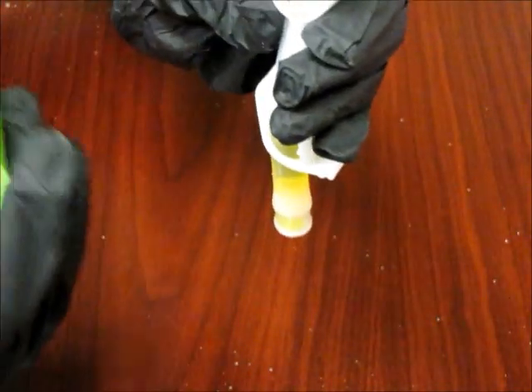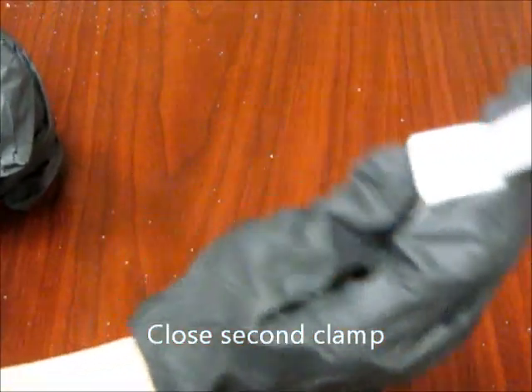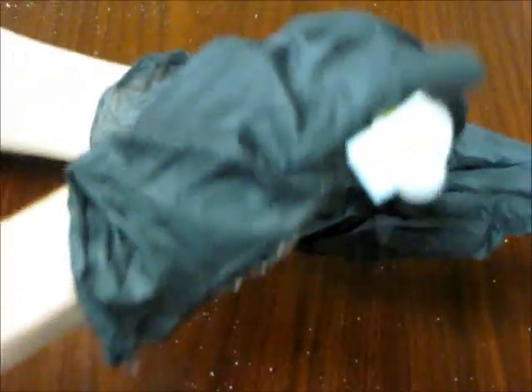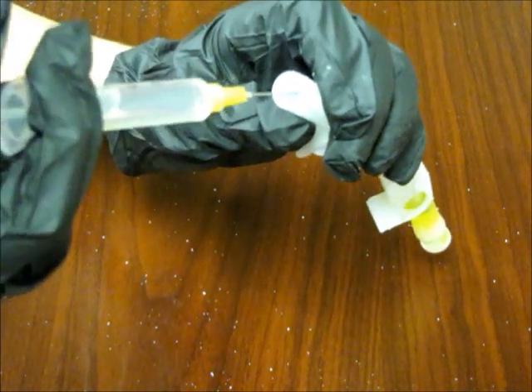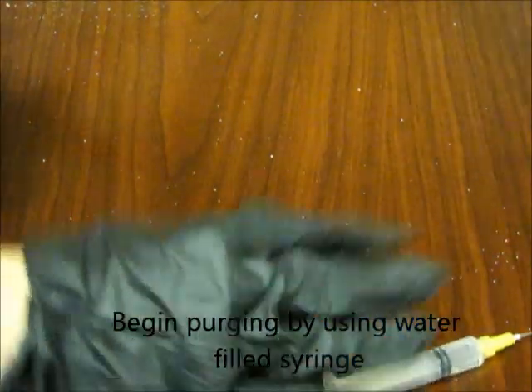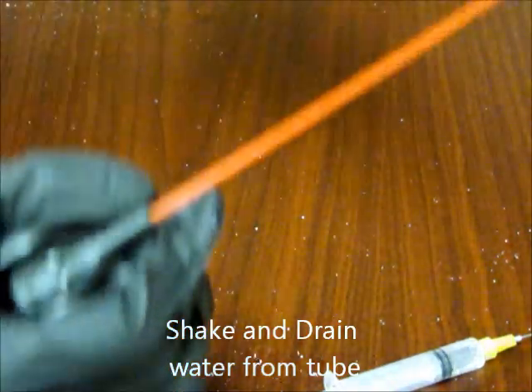Once this is complete, you may close the clamp on the second chamber of the tube, shutting it tightly so none of the solids can escape. You must then purge the third chamber using a water-filled syringe to fill that chamber with water. Then shake it and drain the water from the tube. Then use the compressed gas to finish purging the third chamber.